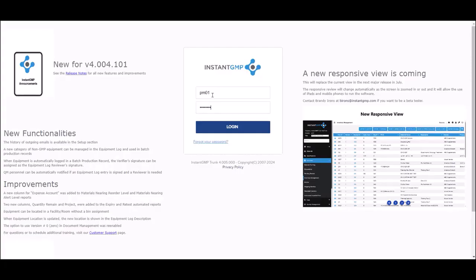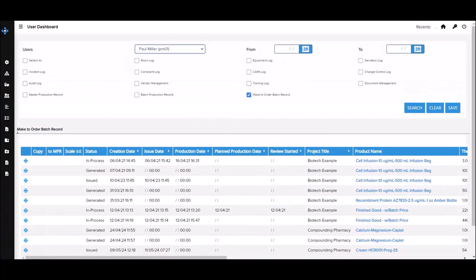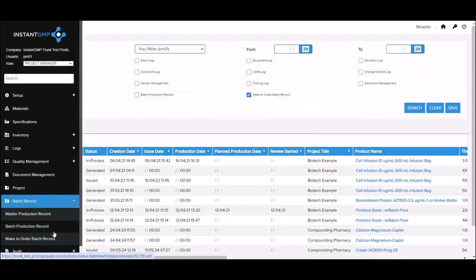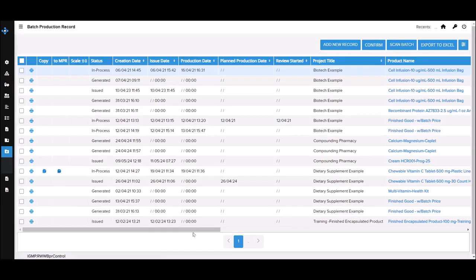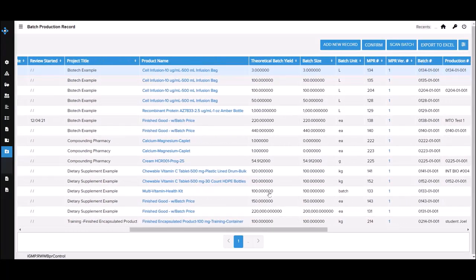This feature seamlessly connects your equipment to our software, enabling automatic data transfer. By integrating your equipment, you can minimize GDP errors, instill confidence in managers, and streamline data entry for operators.